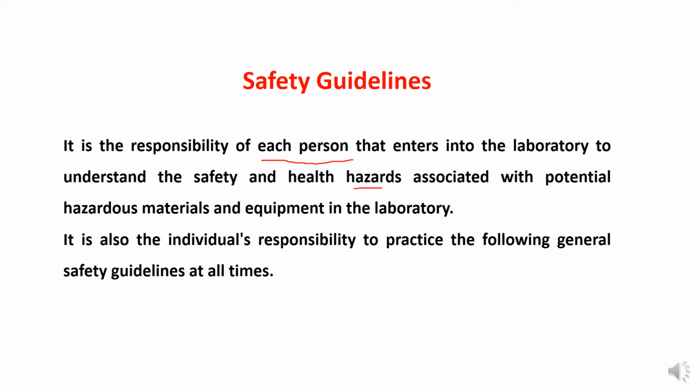They should also understand and remember the hazards associated with potentially hazardous materials as well as the equipment. The laboratory equipment also has some hazards, which we will cover in the equipment safety lectures. But all this information is very important if someone is going to enter the lab for work.